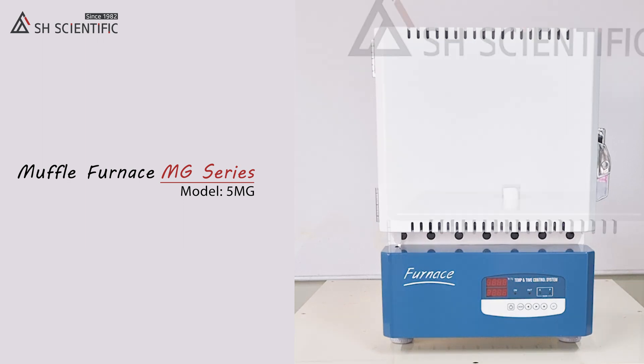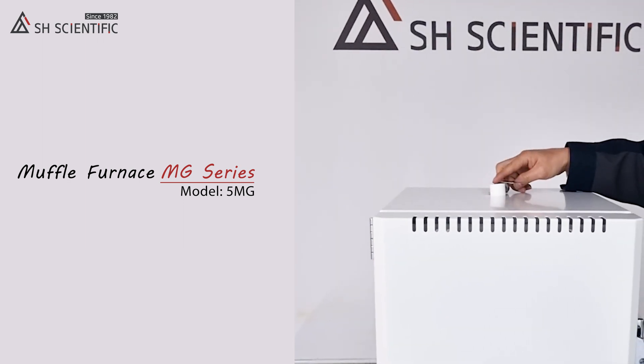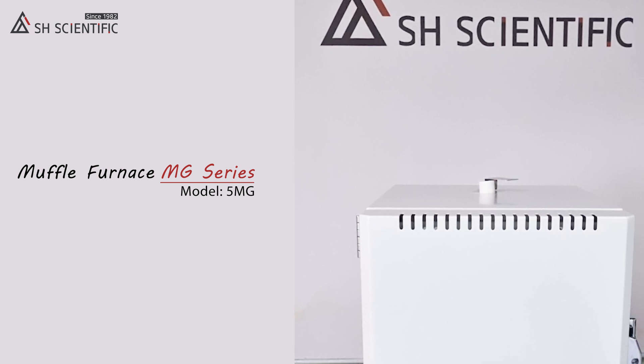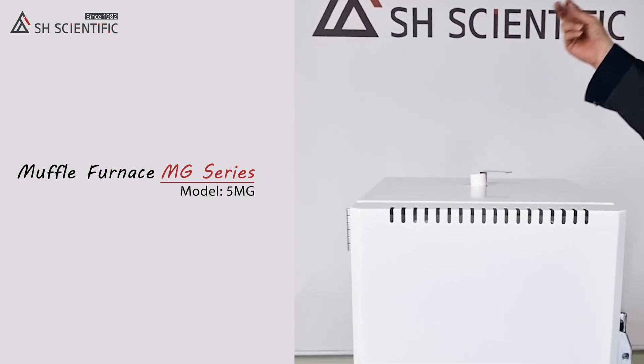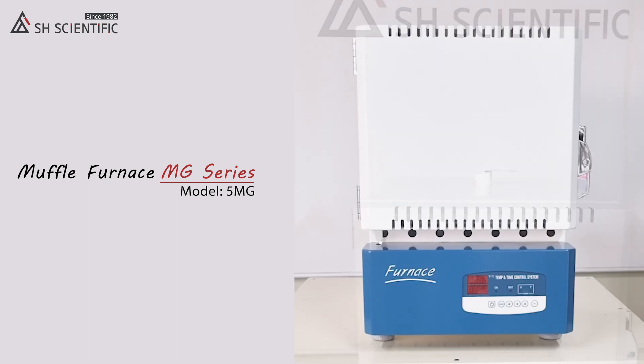All our muffle furnaces have an exhaust port on top, so remember to open it if your sample will produce volatile gases or fumes during processing. You can connect a pipe for venting.